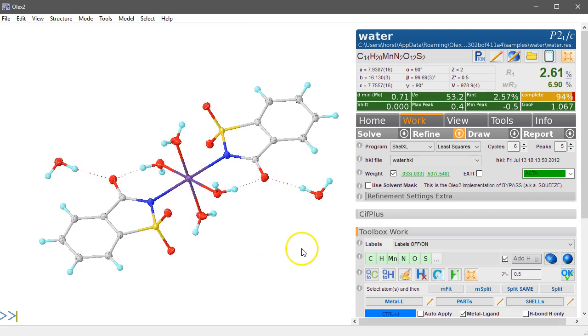I hope this cleared up the matter a little bit. So the formula unit is something that you really want to choose as a chemist. And you can adjust that with the value of Z prime, which you can adjust in toolbox work. And then Olex 2 will look after the rest. Thanks for using Olex 2.